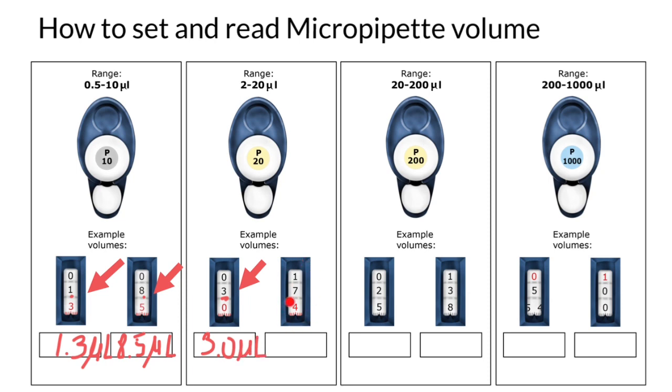Now you also know that this is not going to be 174 microliters, but again, we can put a decimal point here between 7 and 4, and we read it as 17.4 microliters.